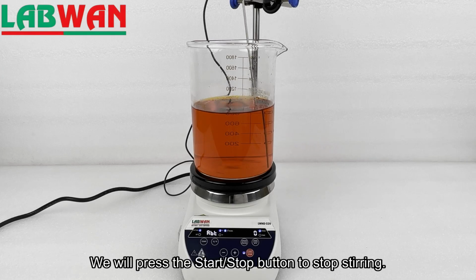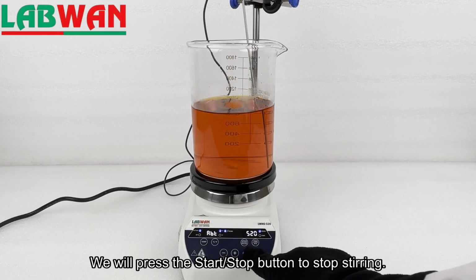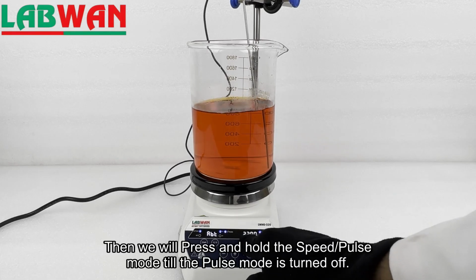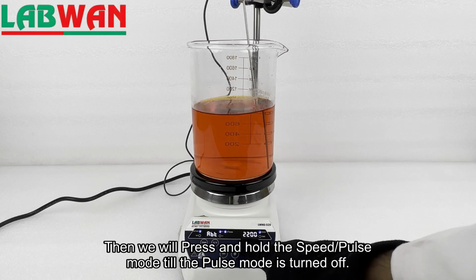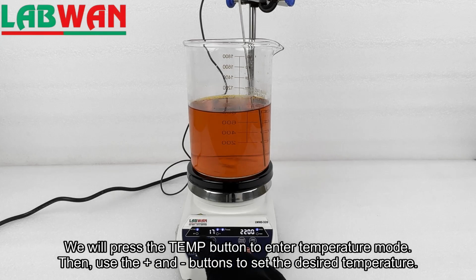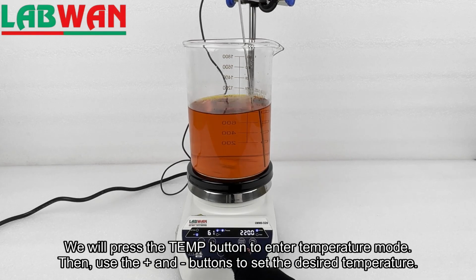We will press the start, stop button to stop stirring. Then we will press and hold the speed, pulse mode till the pulse mode is turned off. We will press the temp button to enter temperature mode. Then, use the plus and minus buttons to set the desired temperature.